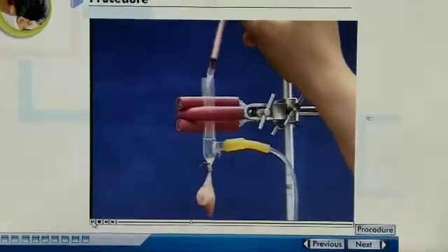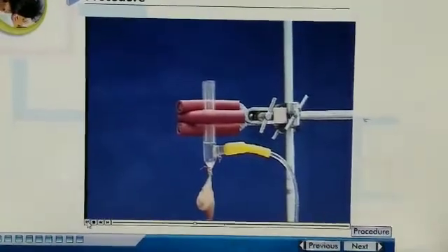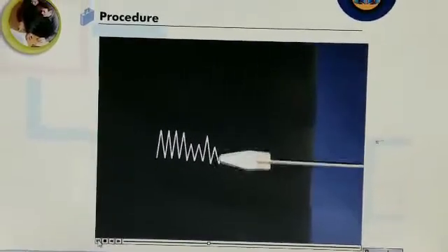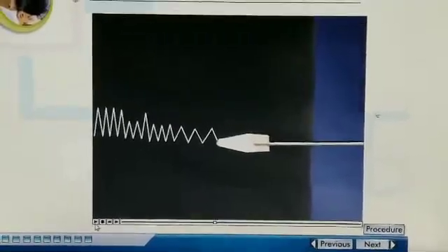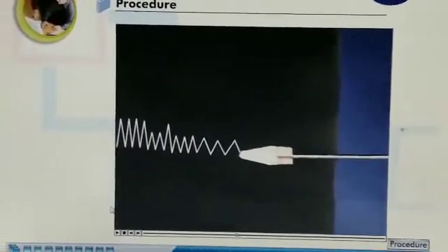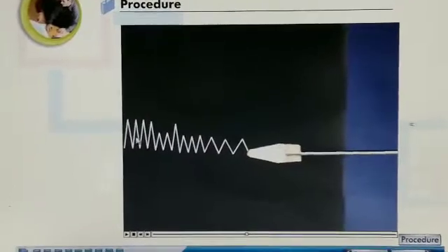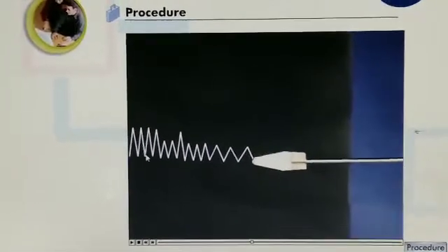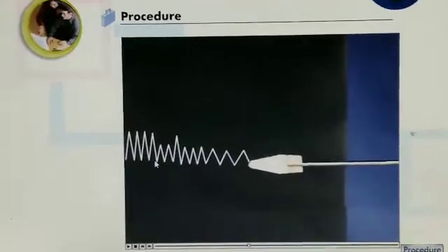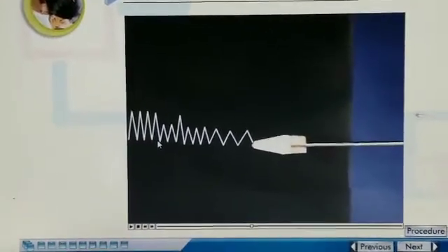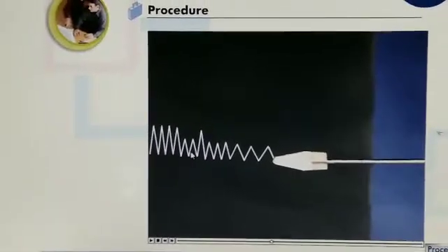Stop the drum and inject 0.1 ml of stock solution of potassium chloride into the cannula. Start the drum immediately and record the response of the heart on smoked paper for one minute. After injecting potassium chloride 0.1 ml, the height of the peaks is decreased and the distance between peaks is somewhat increased.